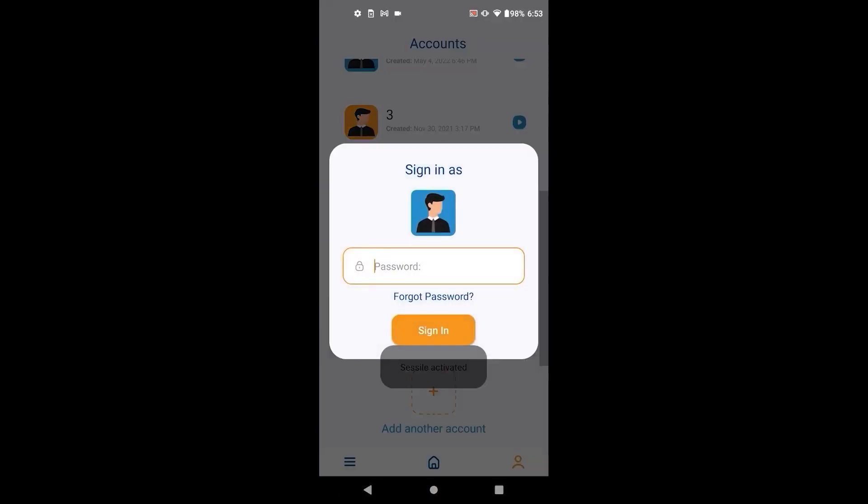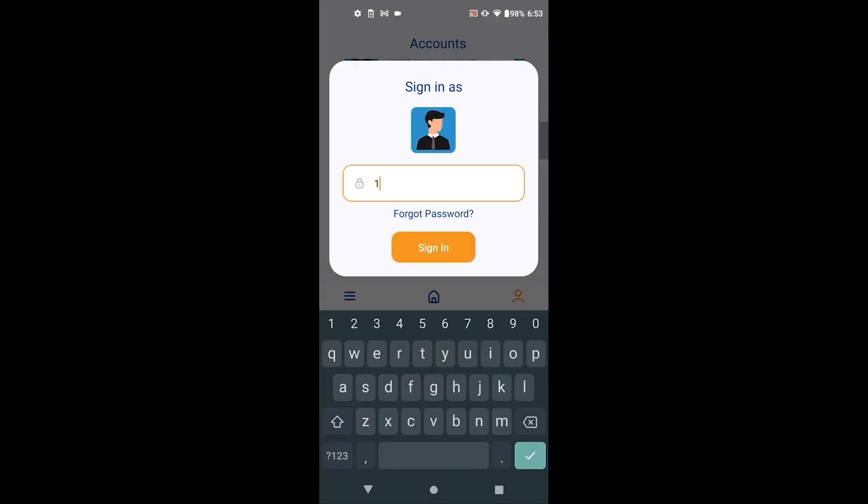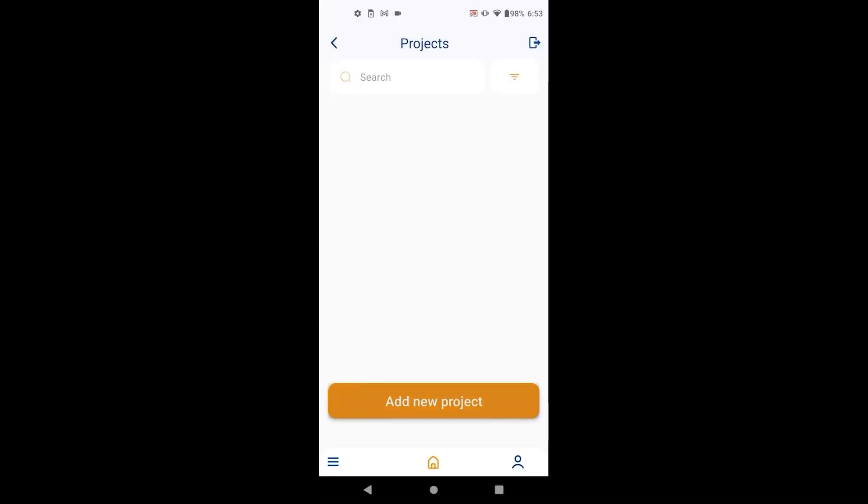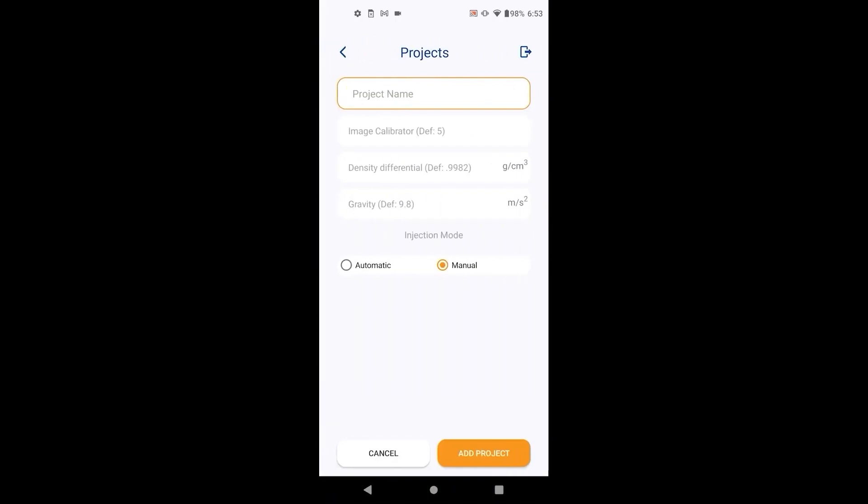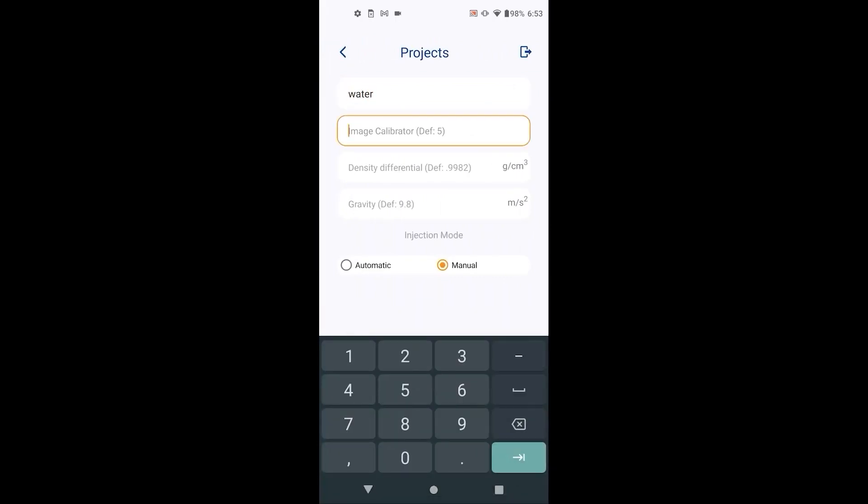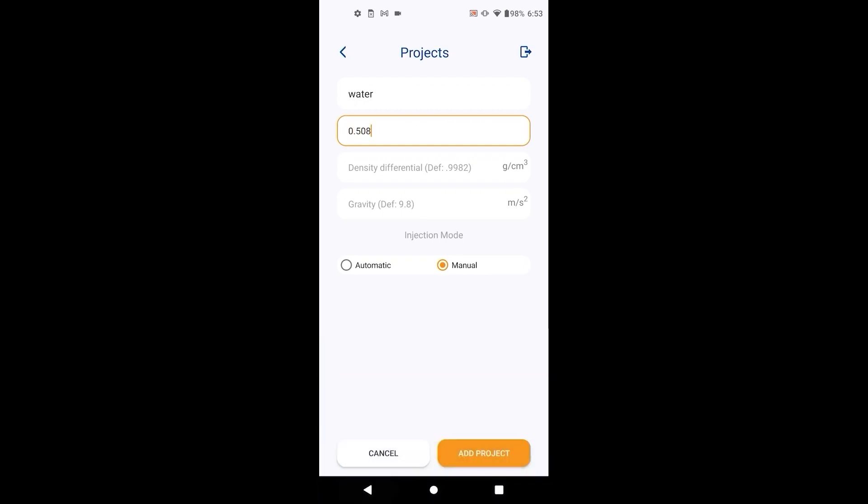After creating an account or signing in, create a project. This includes first the project's name, next the image calibration number which is the outside diameter of the needle being used in the experiment.